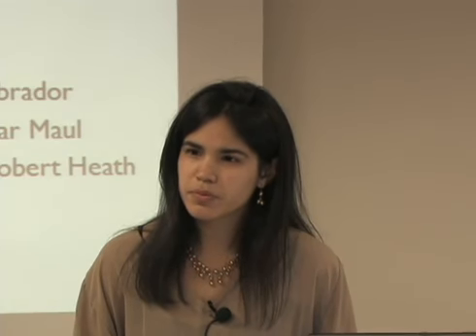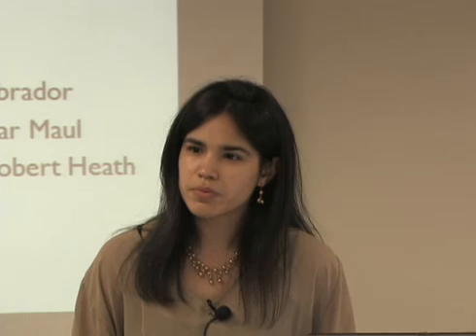Okay, questions. Hi. I see in some of your pictures that for some particular values, even though you have a large amount of a compound that you extracted, when you compare that with other values of the Kovats index, sometimes you have big error bars, sometimes you have small error bars. The error bars are sensitive to the index.